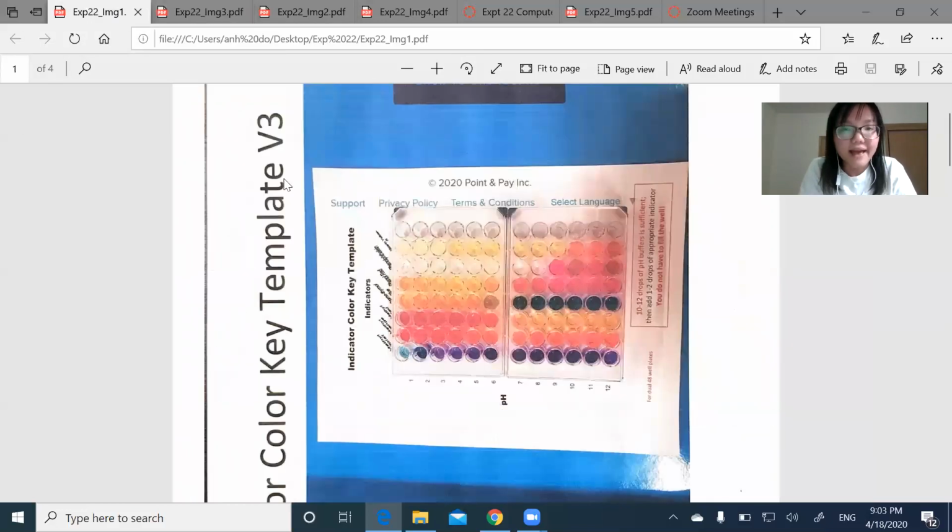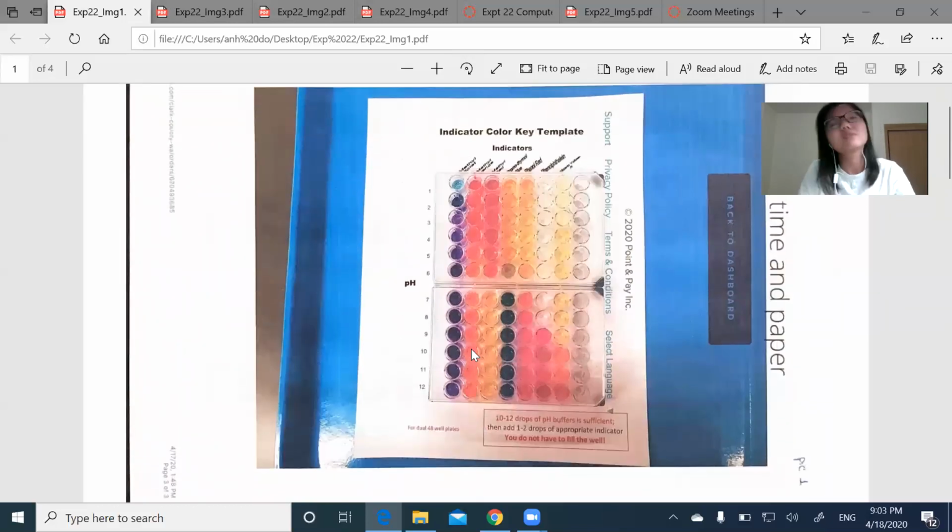So let's go back to this picture. Rotate it. Yep. So like that. If everything is around yellow and there's only one clear spot, and it would return to the yellow color again, then immediately it would tell you that NaCl has to have a pH of less than 8 in order to have a clear color.